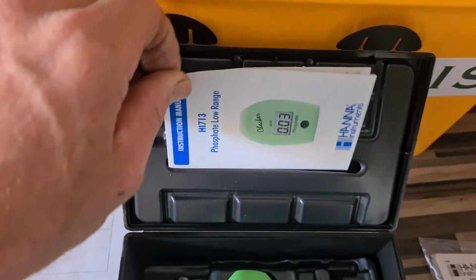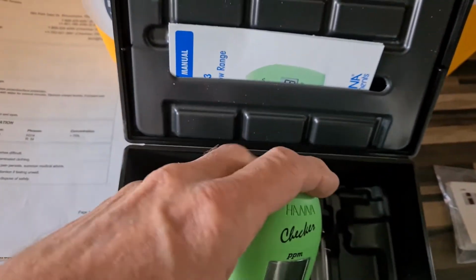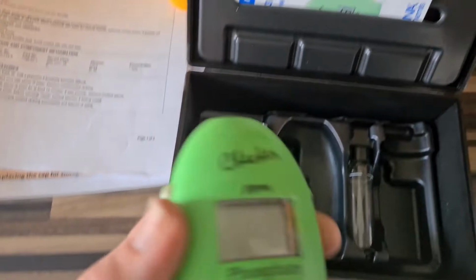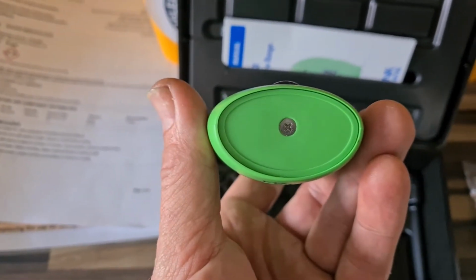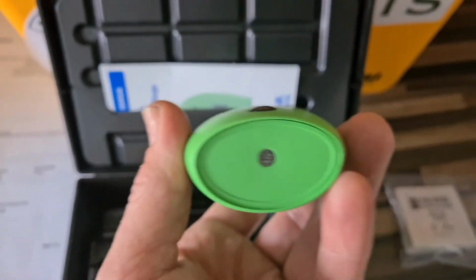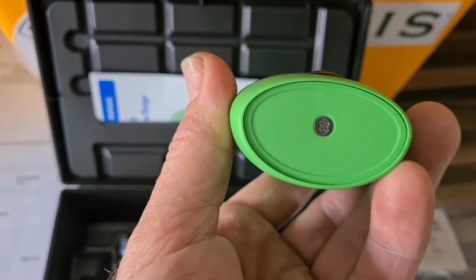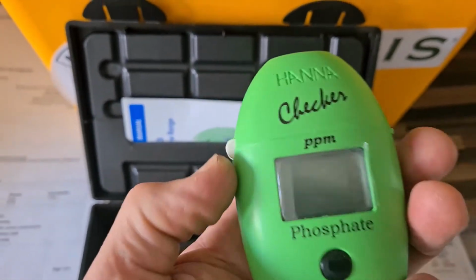Instruction book on the top. This is the digital phosphate checker. Okay, I've put the battery into that, but it comes without it installed. The battery's normally in there. Okay, screw on the bottom for the battery compartment. When you take this off to put the battery in, just be careful how you take that bottom lid off, because there's a little 6-pin connector on this side. So just don't really lever it up too much if you can help it.